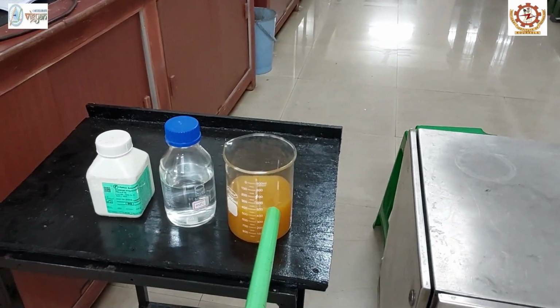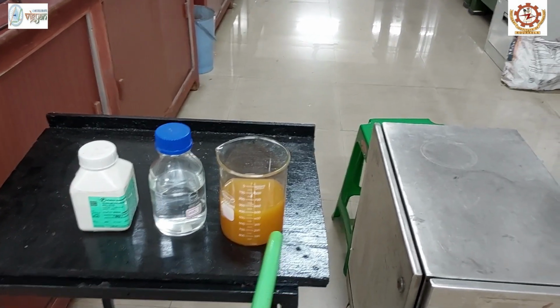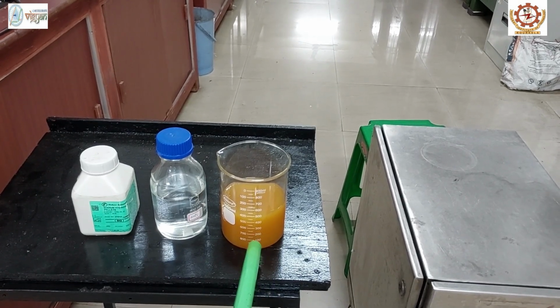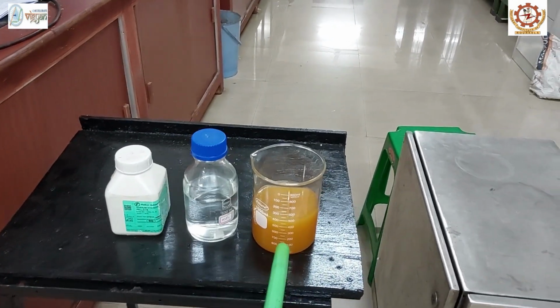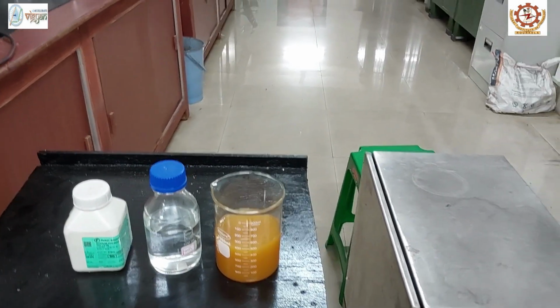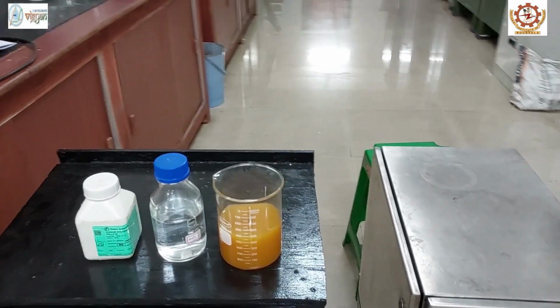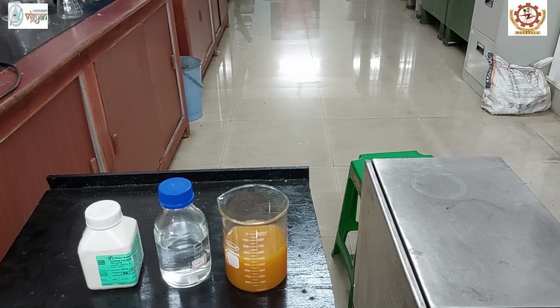One of the basic applications of membrane filtration is clarification. So here we are going to remove the turbidity and haziness of this particular mango juice using the membrane filtration system. Another application of membrane filtration is cold sterilization. Fruit juices contain a high amount of microorganisms such as bacteria, yeast and mold. A membrane filtration system can be utilized to remove these microorganisms from the fruit juice.